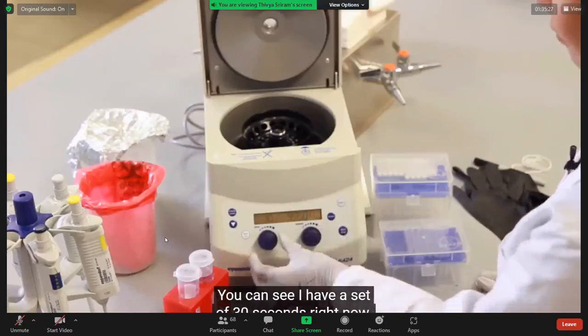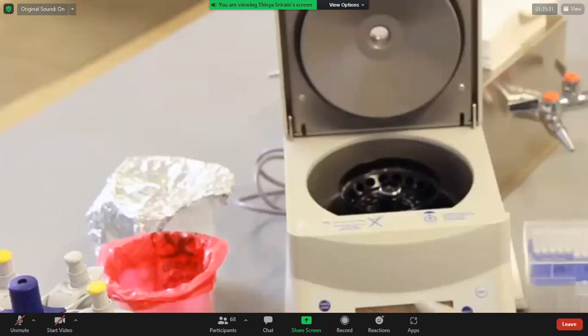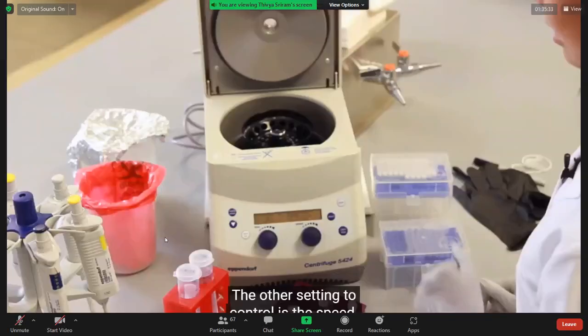The first one is time. You can see I have it set to 30 seconds right now. I can also increase or decrease the time as I see fit. I'm going to leave it on 30 seconds.